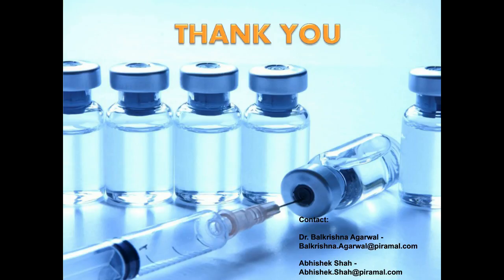Yes, during my entire discussion I was mentioning this, and it is one of the key points. If you have a packaging material for one drug product that is aqueous, and you want to use the same packaging material for a different drug product, you definitely need a different report and a full-fledged extractable and leachable study, because your drug product plays a very important role in the study.